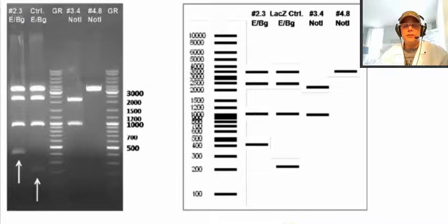Now over here, this is just a simplified picture. Actually, wait, this is an actual gel electrophoresis picture. On this right side, you will see the standard with the known base pairs, how long they are, so that you can measure how long these are and then compare them against each other. Over here, it's the same thing really. It's just drawn a little bit more clearly.